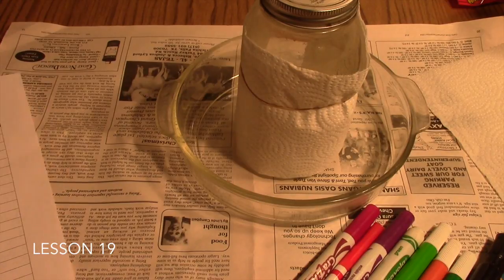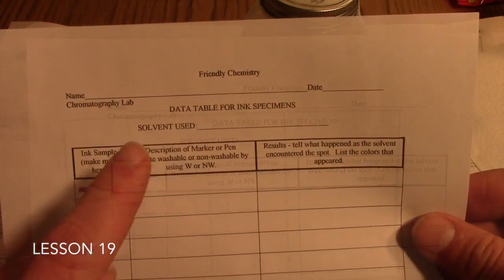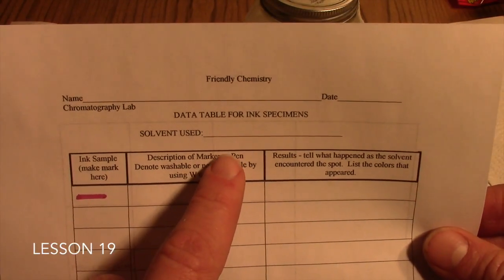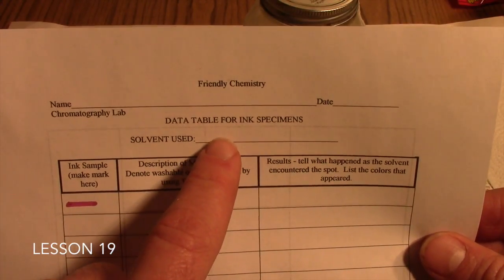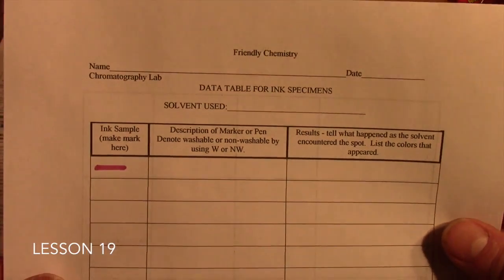Let's take a look here at the data table that your students will have in their textbook. At the top of the data table, there's a place for their name and date, and then there's a blank to put the solvent that you're using. In our example here, we put water. If you're using the fingernail polish remover or alcohol, you'd put those there.